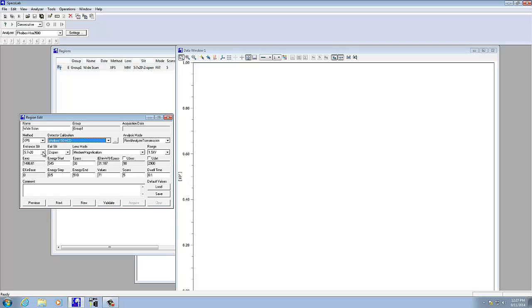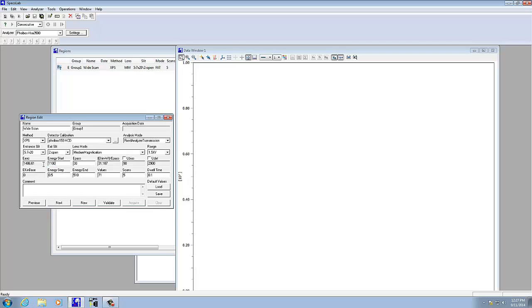If it's something different than you want to set it to that, those numbers are written right here on the computer. You can change the magnification in lens mode that determines what area you're sampling. In this case, I'll leave it as medium magnification. Instead of doing a wide scan, I'm going to go from 1100 EV down to 0 EV.